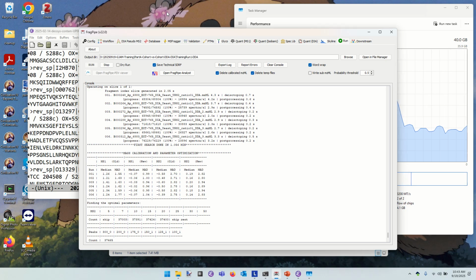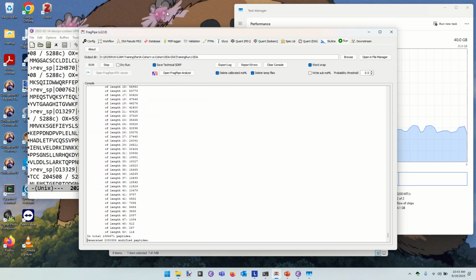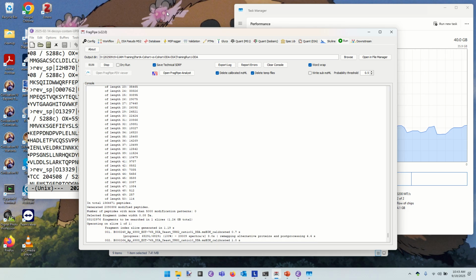Right. So there are several parameters that it can optimize in how to do this search, and it's doing that to increase the fraction of the spectra that it can explain properly. Remember at base that we're asking the software to say, what peptide sequence does each tandem mass spectrum represent? Okay, and with that, it's into the main search. It's got these 6 files, and so each one of those needs its thousands of spectra compared to peptide sequences.